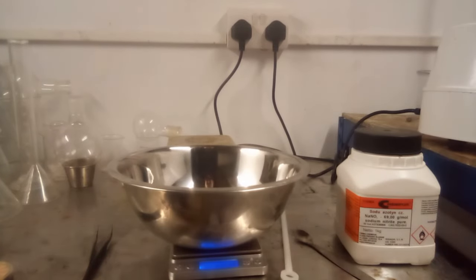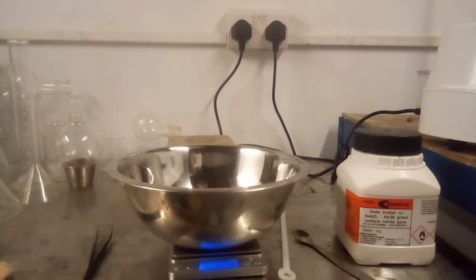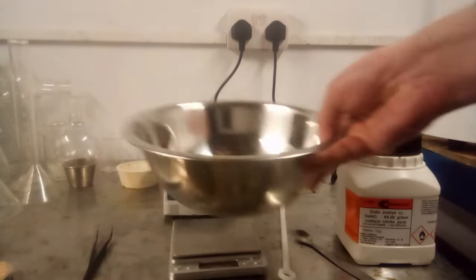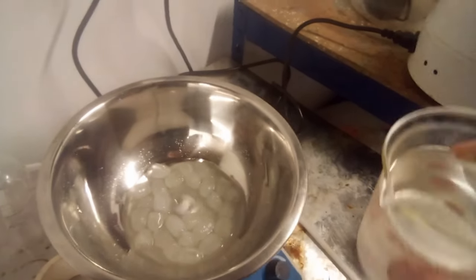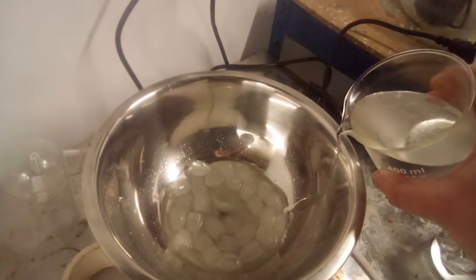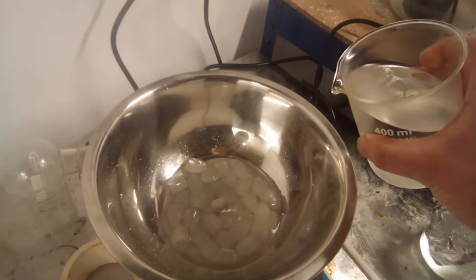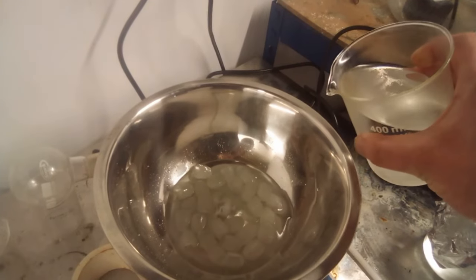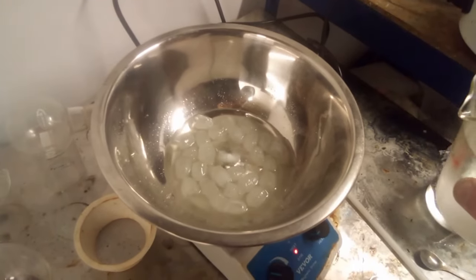Sharp-eyed viewers will notice the container is a 2-litre mixing bowl of the kind normally found in kitchens. I've got no beakers that are big enough, and even if I did they'd be too tall to fit in the fridge. Once most of the nitrite had dissolved I put a stir bar in the bowl and added the metabisulfite solution to it in small portions slowly and carefully. The reaction between nitrite and metabisulfite is very exothermic and if you add it too quickly you can actually feel the mixture getting warm through the base of the bowl.